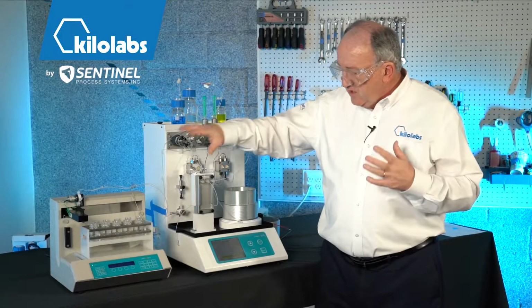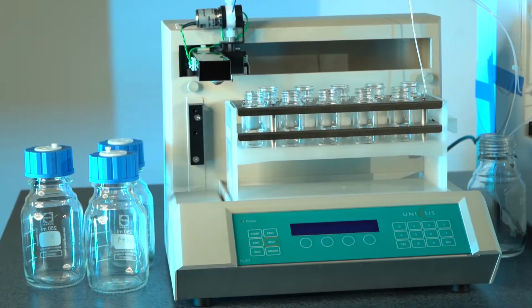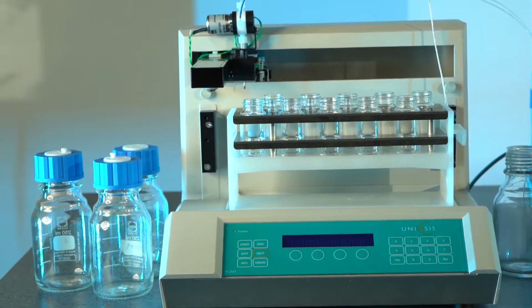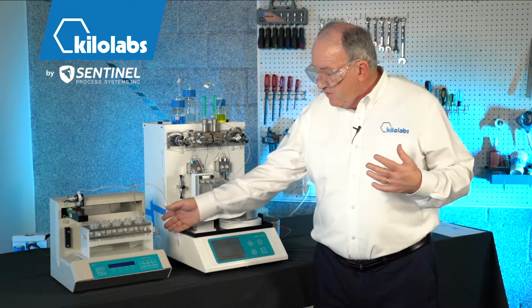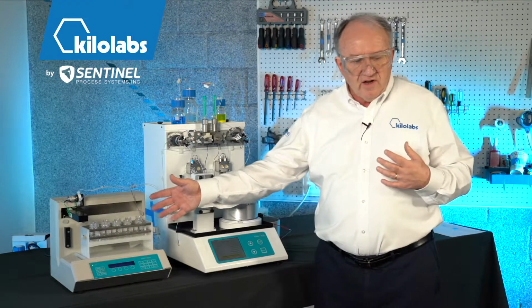Fluids flow through the machine, and we'll show you that in a few minutes. What the fraction collector allows you to do is collect just a reaction product. The system times all the intermediate washings and equilibrium flows such that all of that is diverted to a waste receiver over here, and in essence, only the reaction product is collected.